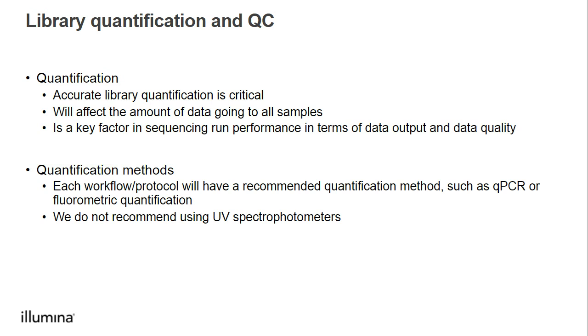Each library preparation workflow will have recommendations for quantification, typically qPCR or a fluorometric method like Qubit or PicoGreen. We do not recommend UV spec-based methods, as these are not accurate enough for sequencing.